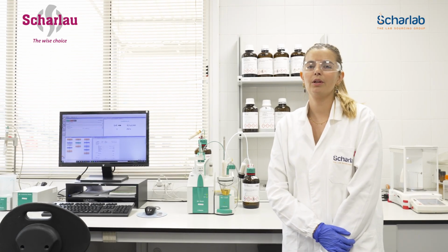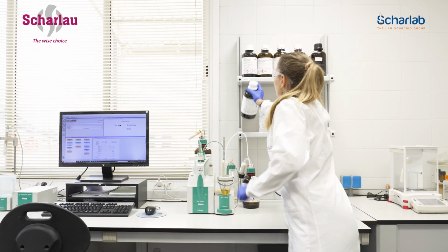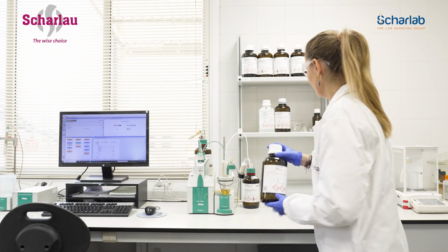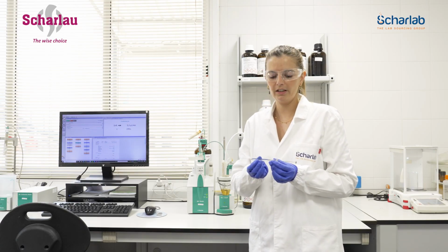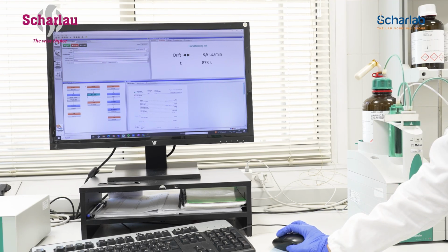For today's measurement, we are going to use a sample of UHPLCMS water. Here, we are working with a sample that comes from the well-known chemical Scharlau brand, specifically labeled as AQ0015. In the previous step, we carefully weighed the sample using a precise syringe to ensure accuracy in our measurements. Now we are ready to move on to the next phase, which involves actually performing the measurement itself.